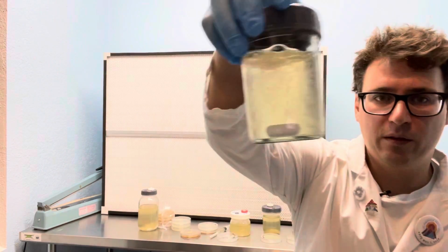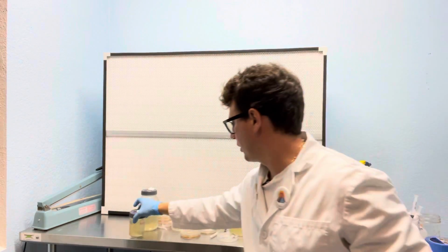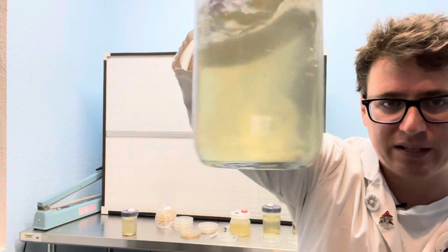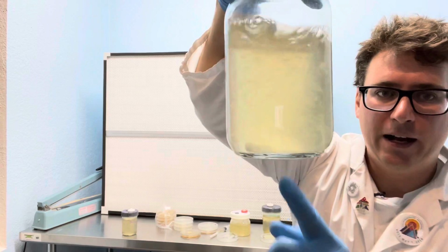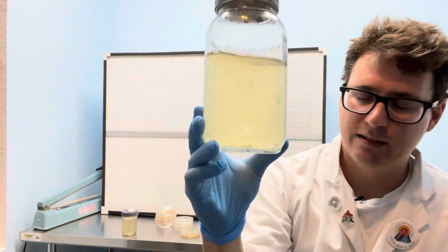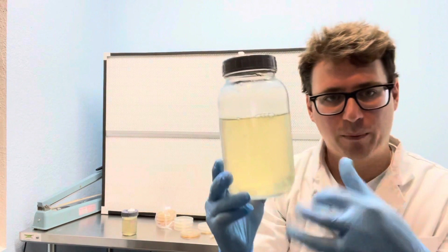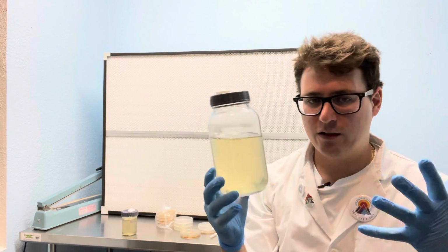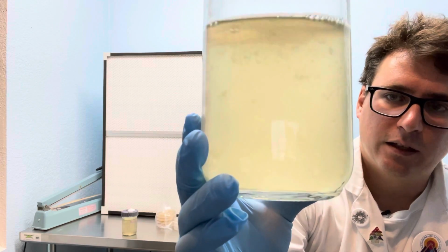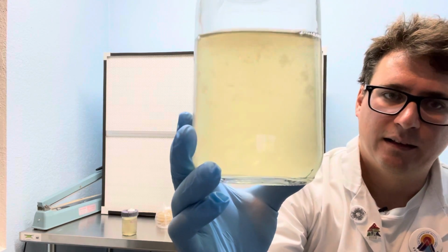These are both really healthy cultures. This is a lion's mane here, and I like to put a stir bar in the bottom so I can mix these for a few minutes at a time, and that way it will break up the mycelium and allow it to expand and really cultivate that liquid broth.